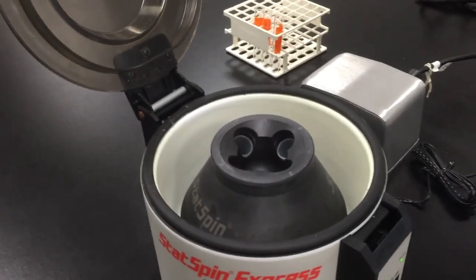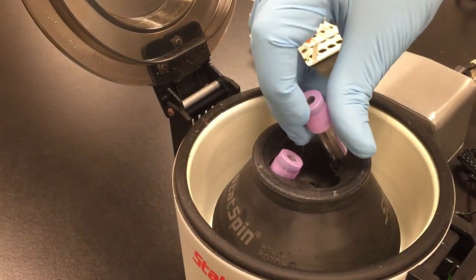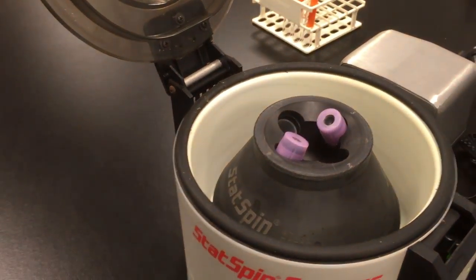Now when you place them inside of the centrifuge, you are going to make sure that they are on opposite ends to make sure that they are balanced.